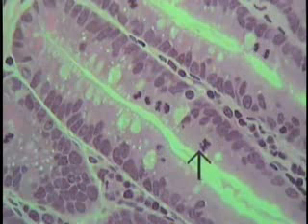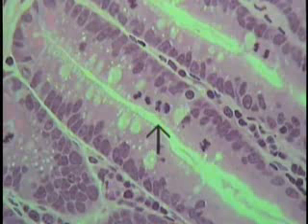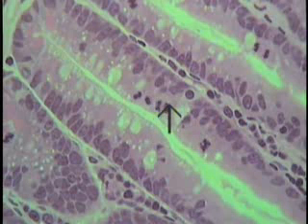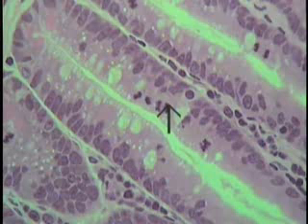So these intense bodies are actually the chromosomes. What is shown in this particular field is early anaphase, later anaphase. The extent of the cytoplasm of this dividing cell is where the pointer is indicating.